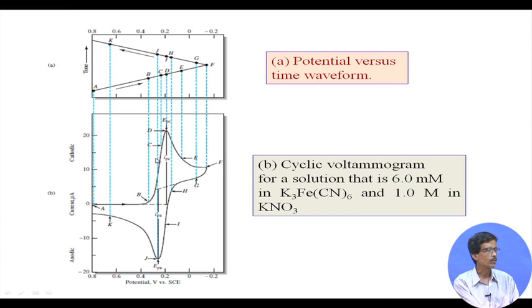So, this will be your cathodic scan, that means we are looking for the reduction of the corresponding ferricyanide ion, which is attached on the electrode surface, that is, the available concentration of ferric ion in the form of the ferricyanide ion on the electrode surface is getting reduced. So, when we move then and turn, that means in the opposite direction, this is your corresponding cathodic scan. So, cathode is responsible for your reduction, and then we go for your corresponding anodic scan.